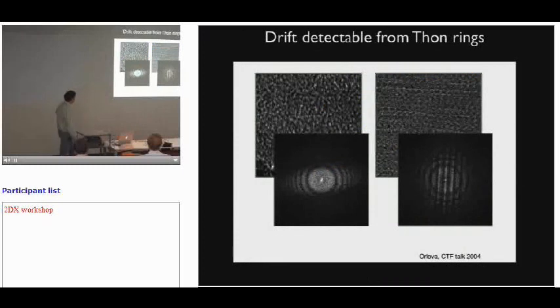Another important thing that you deal with is the drift of your sample. This becomes important for stability because we have to take a certain limited exposure time, and we don't want the sample to move during that time. However, you can detect in the images if you have a preferred orientation of drifting, or continuous drift in this case. In this case, this pattern would correspond to a jumpy type of drift.